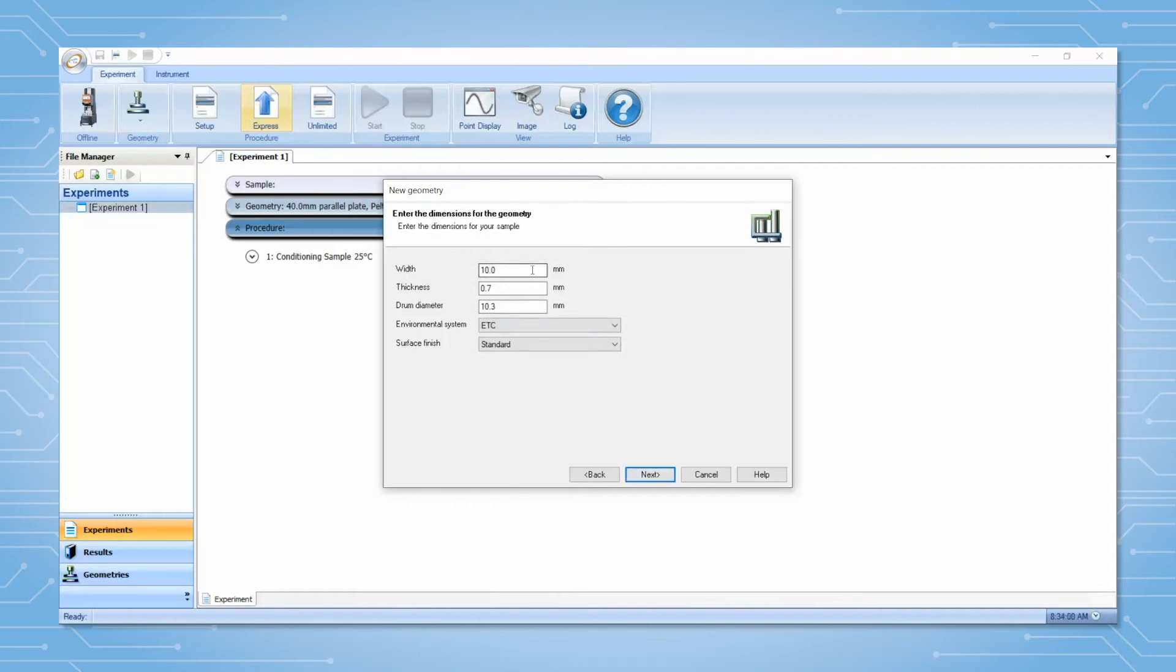Give typical values for your sample, for example 10 x 1 mm. The drum diameter can be left at a default value. Select the drum type, name the fixture, and add any notes. Click Next and Finish.